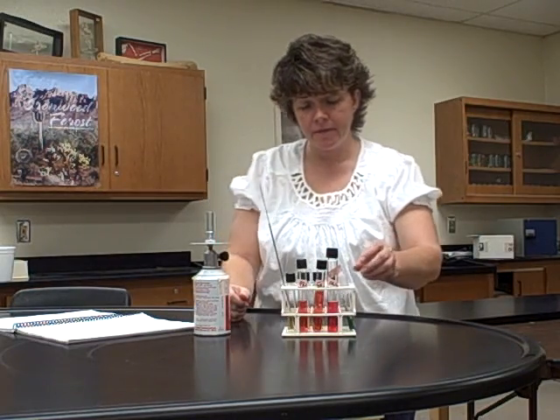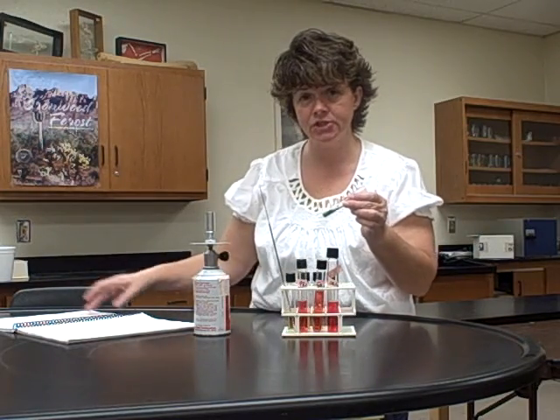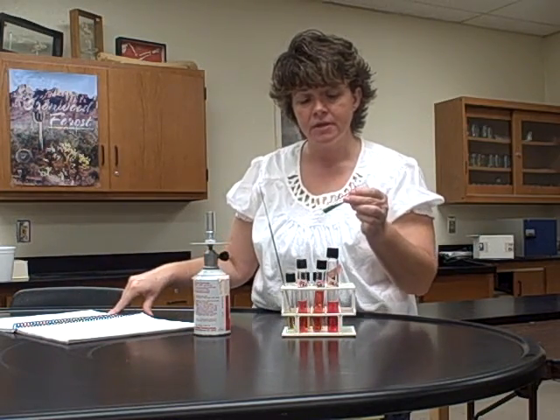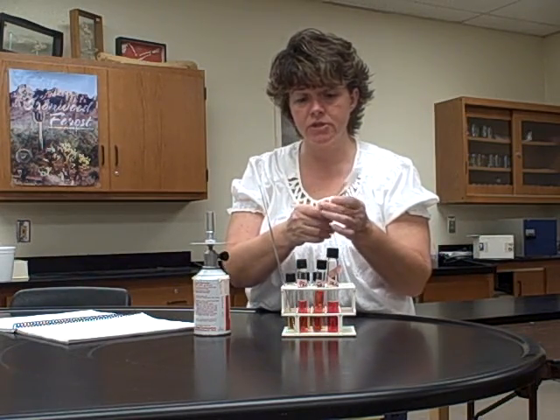Okay? Now, the Simmons citrate one that I had mentioned, remember that's an addition, so you're going to kind of write it into your book. The same thing, whatever bacteria you were assigned, you would put into the Simmons citrate tube.